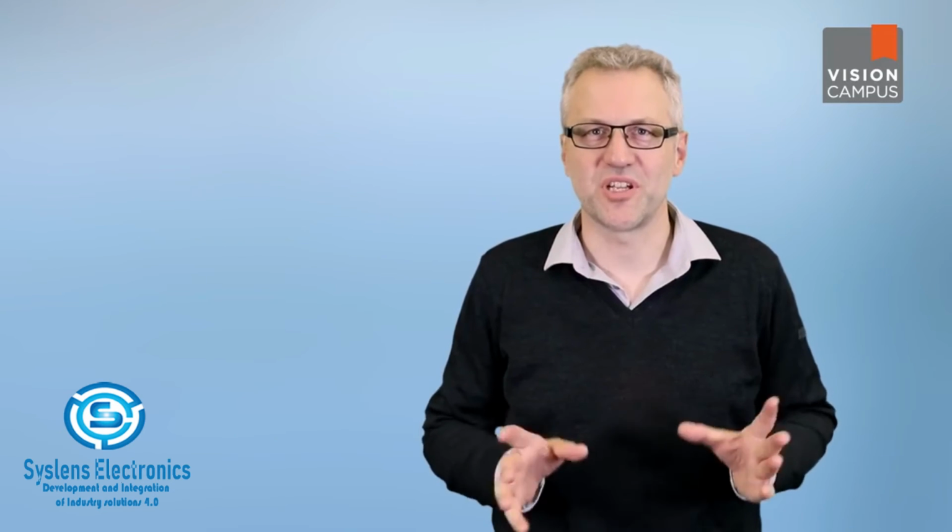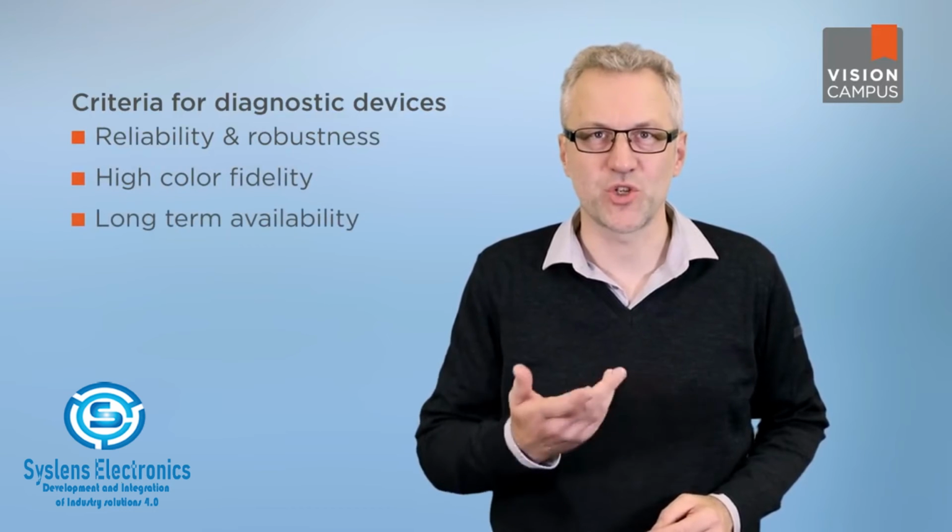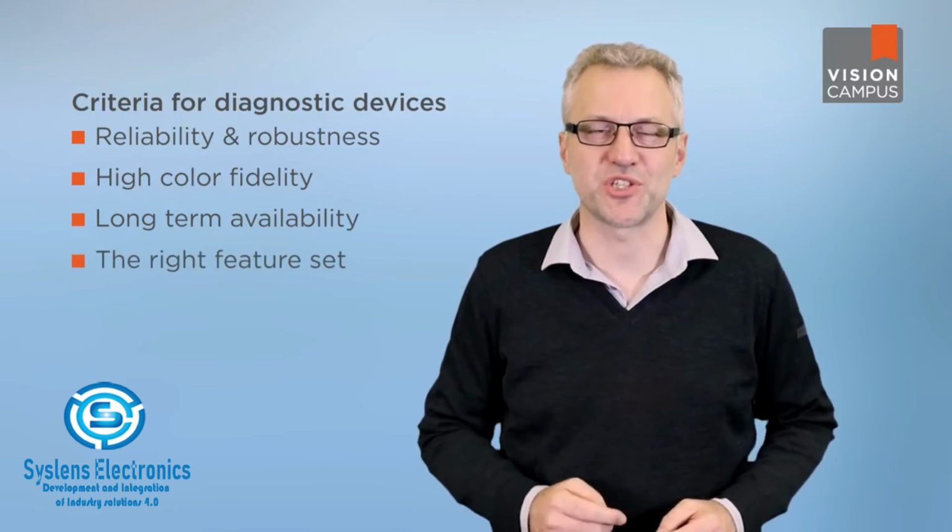Cameras designed for use in medicine and life sciences also face some tough performance and form factor requirements. Because the diagnostic process often depends directly on the camera's image, the criteria that make an industrial camera suitable for diagnostic tasks include reliability and robustness, a high color fidelity, a long-term availability, and the right feature set. The cameras must be manufactured with very high precision to ensure consistent performance. Taking an image of the same region of interest must result in comparable images over time.